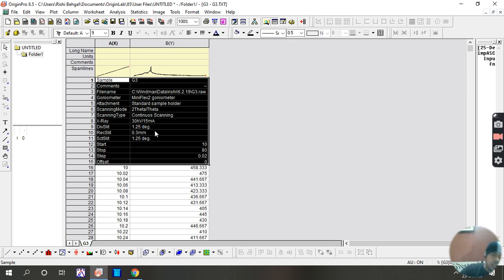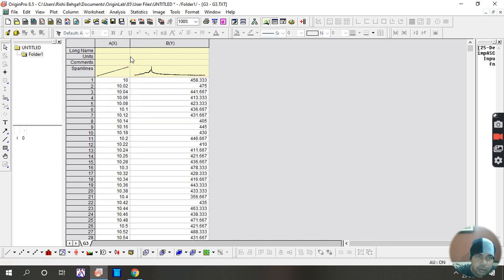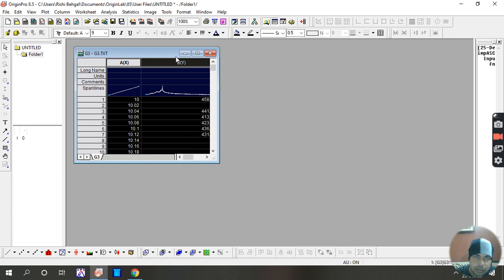These boxes are useful. Cut. See, this is the earlier plotting done by us, similar. Like one more thing, cut it. So this is only a single file, only one data sheet. If we have another data sheet here, we can similarly import the other data and plot.